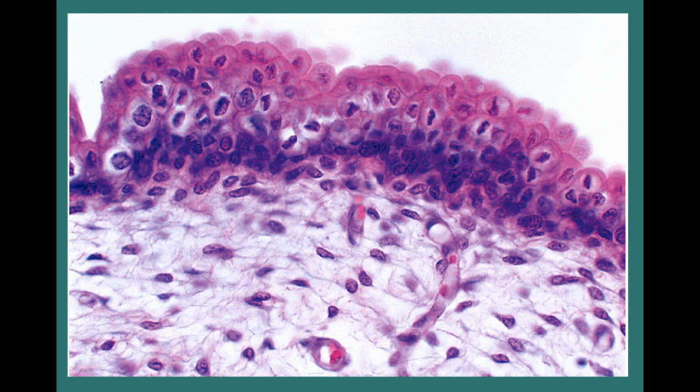So hopefully what you noticed here was that this is multi-layered, and so we have a difference in staining right along here. It's kind of hard to see that direct basement membrane, but again, much more clustered. This tissue up here is much more clustered with nuclei. Down here, those nuclei are much more sparse.